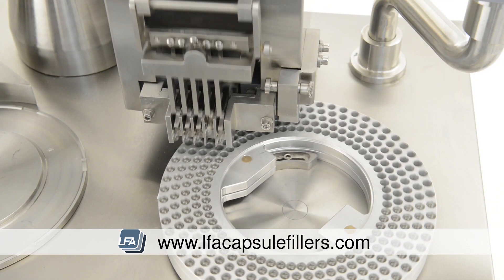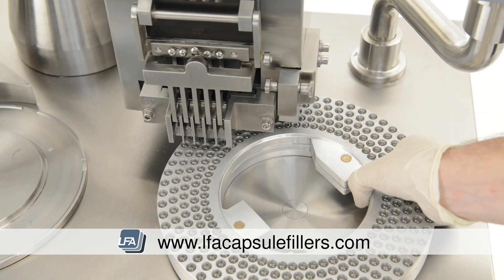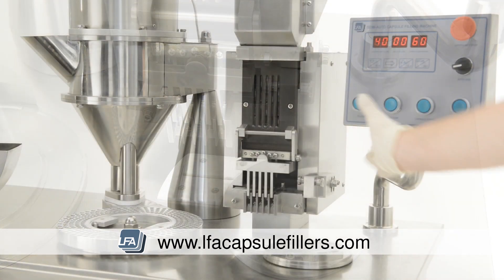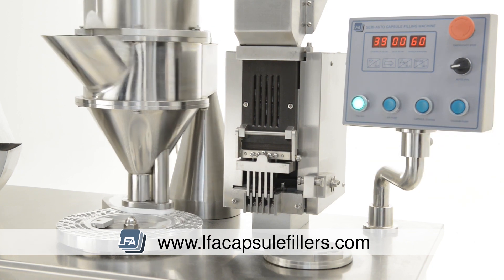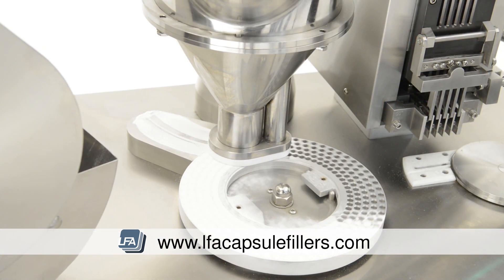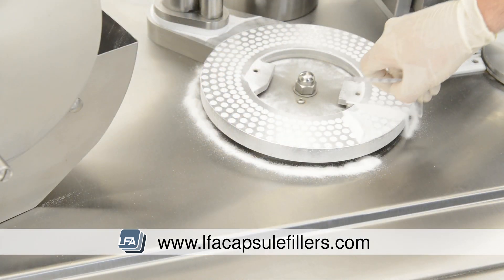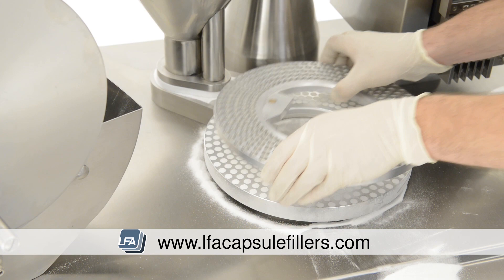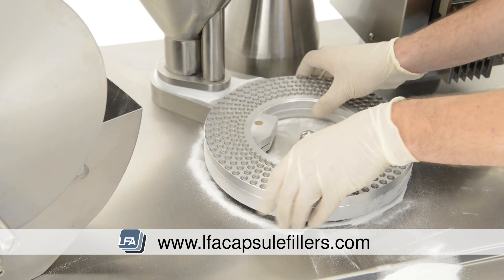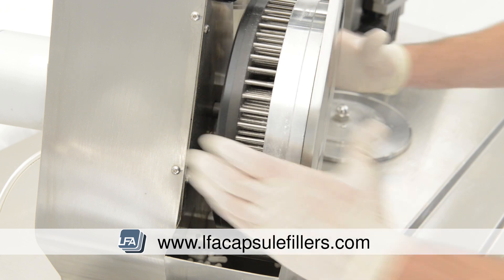The capsule process happens in three easy steps. First the capsule disc is filled, and then the powder is spread evenly across the top. Finally, the capsules are securely pressed.